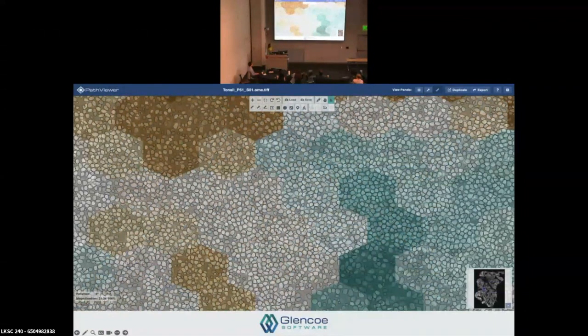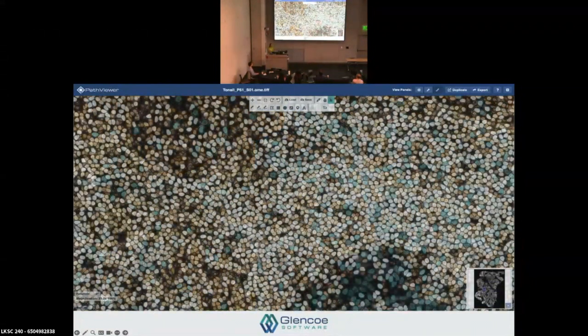And what you can see here is that from blue to brown, we're color coding based on the local average of the area of the underlying objects. And so you can say, oh, I want to go find that hotspot of really big objects. And then, of course, once you zoom in, you can switch back to the actual nuclear segmentation and just color code the primary objects themselves without having to look at this heat map style view. And so we just created this sort of parallel representation of the segmentation results so that people could explore at different scales of their original images.